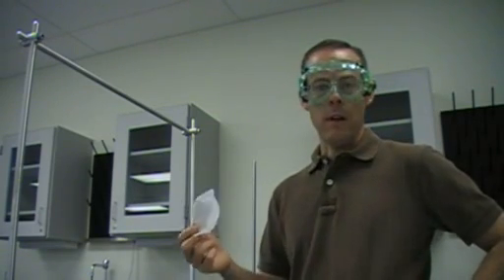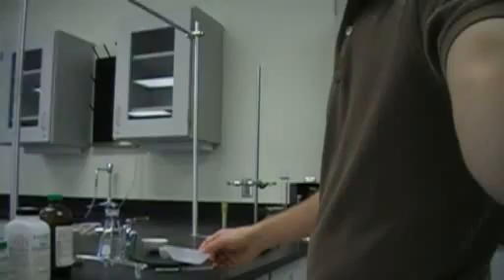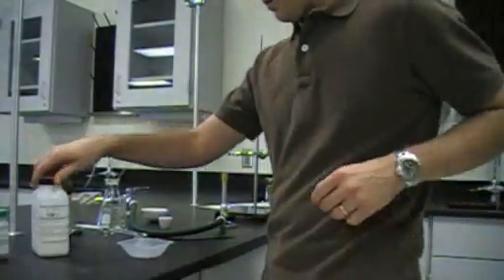What we're going to look at is several different pieces of equipment. We're going to do an experiment, you'll be doing this later in the year. But this is a weigh boat. There should never be anything chemical-wise that goes directly on an electronic balance. It might be in a weigh boat, it might be in a beaker, a flask, possibly a graduated cylinder that you would weigh. We're never going to weigh chemicals directly on the scale.